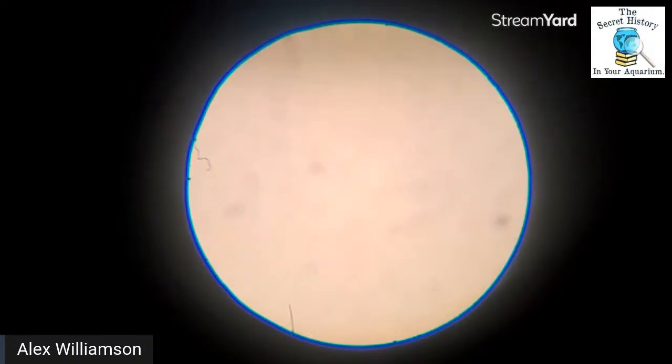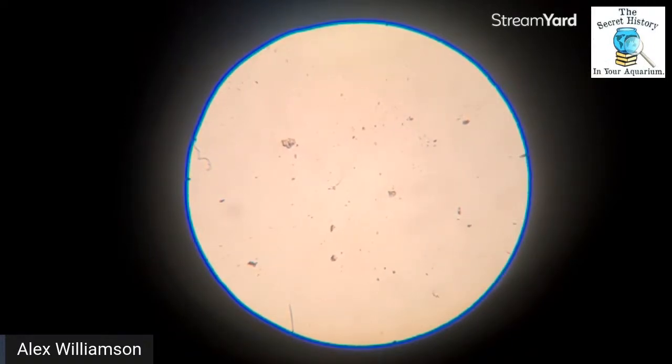Where are all the little creatures that were cruising around all over the place for us a minute ago? So, what you're looking at here, these little dots, when they have a perfect margin like this, they're usually little cysts. If they're not moving, they're either dead single cell organisms or they're eggs, they're cysts. And they're just kind of interesting to me because they're in the water floating freely.